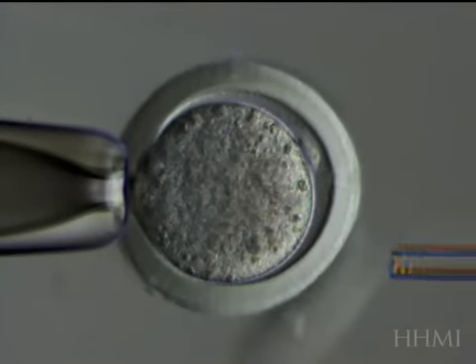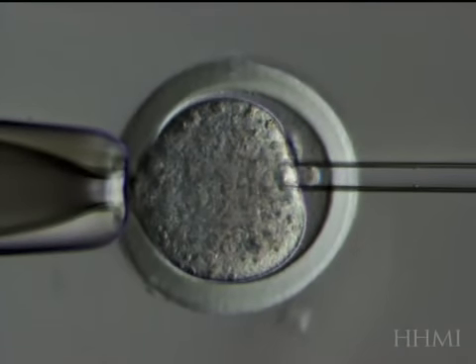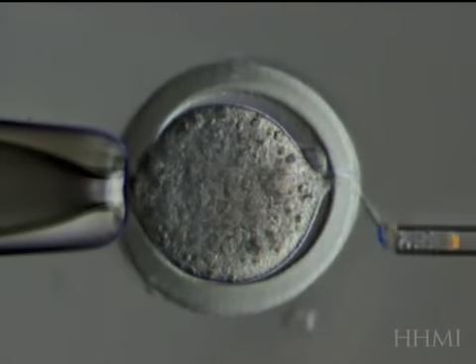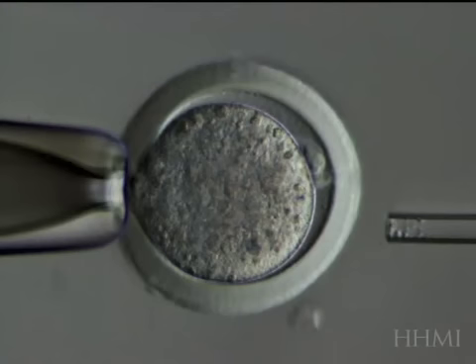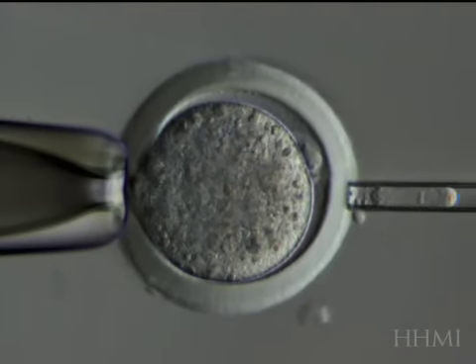This pipette — you'll note it isn't really sharp like a syringe. There you can see a bit of the hole. Now the pipette is going to go in and remove the nucleus. If you look carefully in the pipette, you'll see a line in the nucleus, which are all the chromosomes lined up.